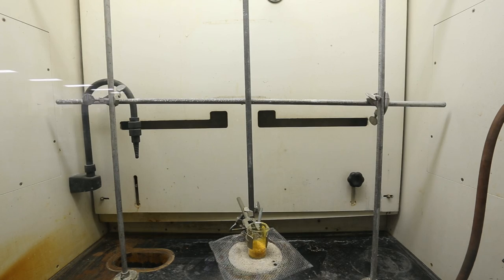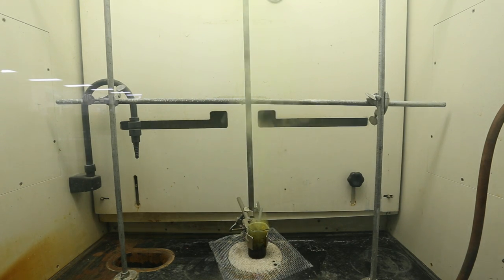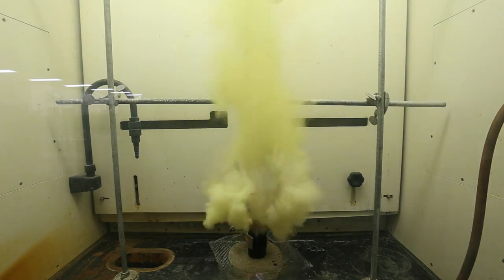This reaction was done with about 10 grams of P-Nitroaniline with at least 10 drops of concentrated sulfuric acid. The reaction was clearly more violent, and I believe that the correct amount of sulfuric acid to use is somewhere in between the amount that I used in both runs. Of course, taking into account that double the amount of P-Nitroaniline was used here. Although I did not achieve the result that I was expecting, I'm still satisfied with the results.